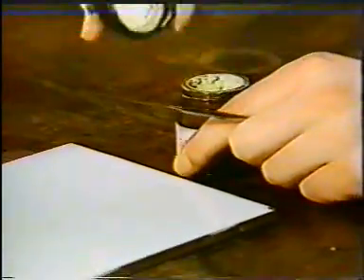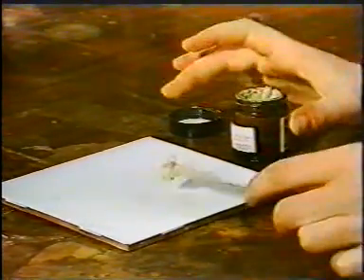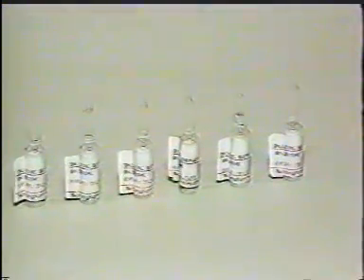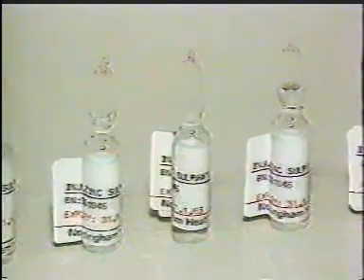Here are some examples of unsatisfactory products. This coal tar ointment contains many black specks. It has not been rubbed down satisfactorily. These ampules of zinc sulfate injection gave widely variable assay results, indicating inadequate mixing.